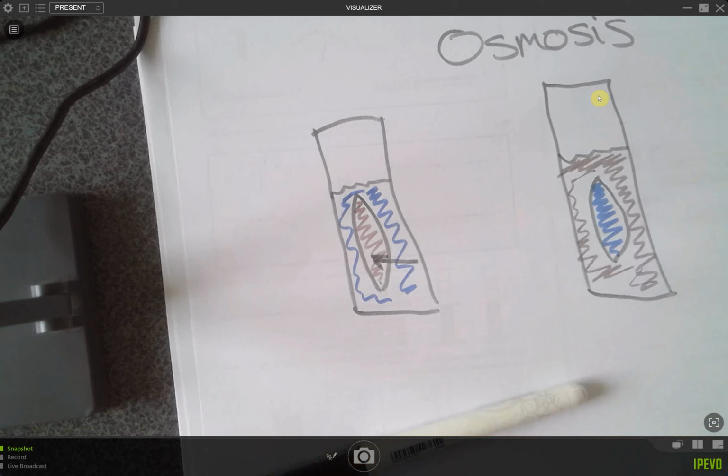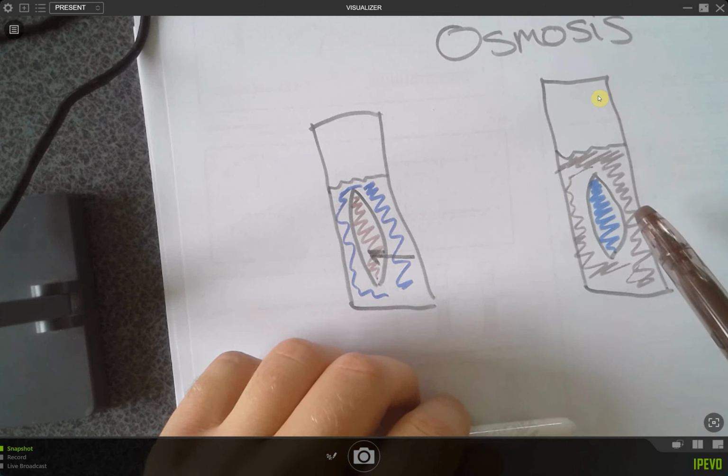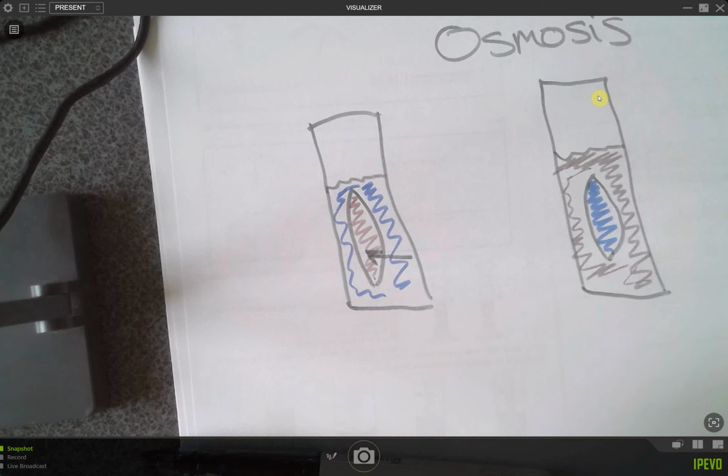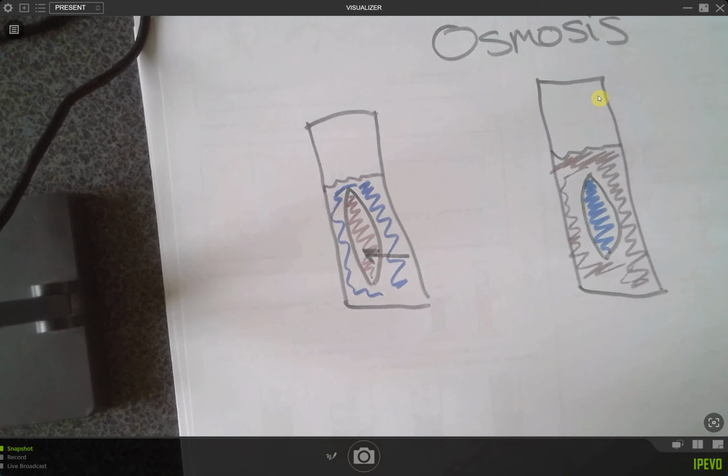And so knowing that water moves from a high concentration to a low concentration, you guys would have seen that the water actually went out of the bag. And so the bag got lighter, right? So it's all about this water movement.